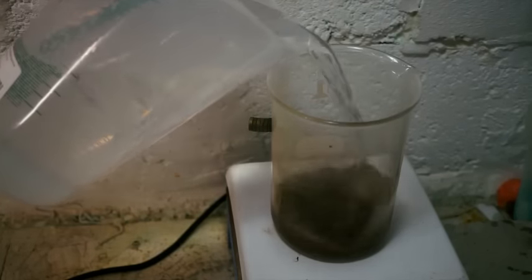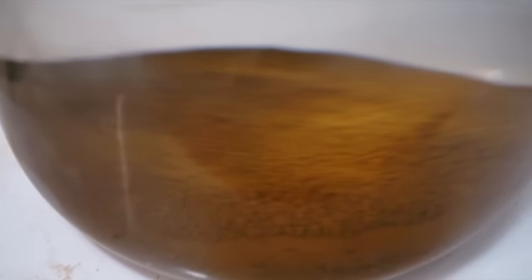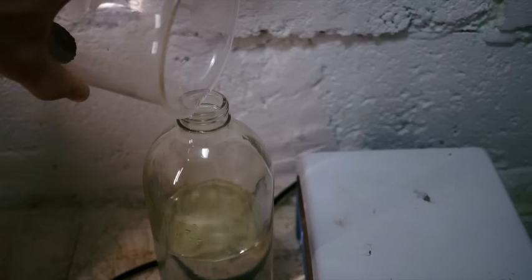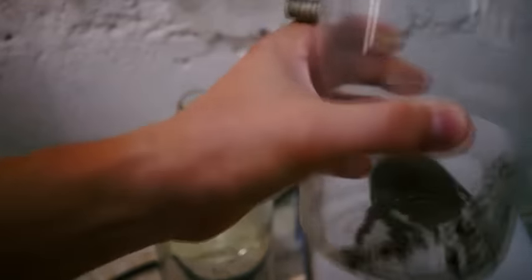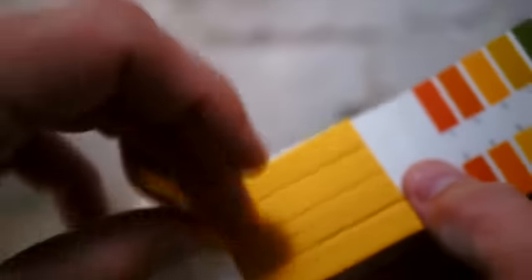We will now rinse the gold powder with hot water. After allowing the gold to settle, we can pour off the wash water. This wash water can immediately be disposed of after adding a small amount of baking soda and then checking the pH to make sure that it's above 7 but below 10.